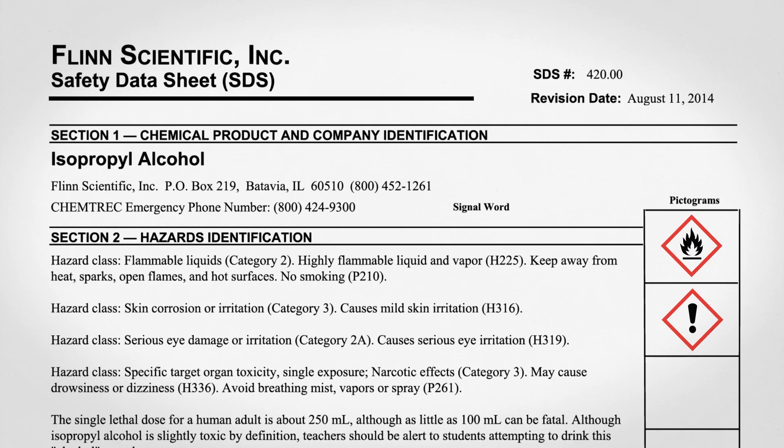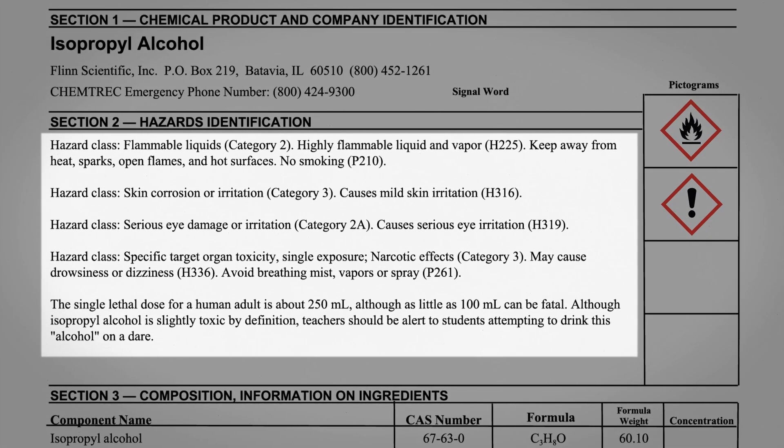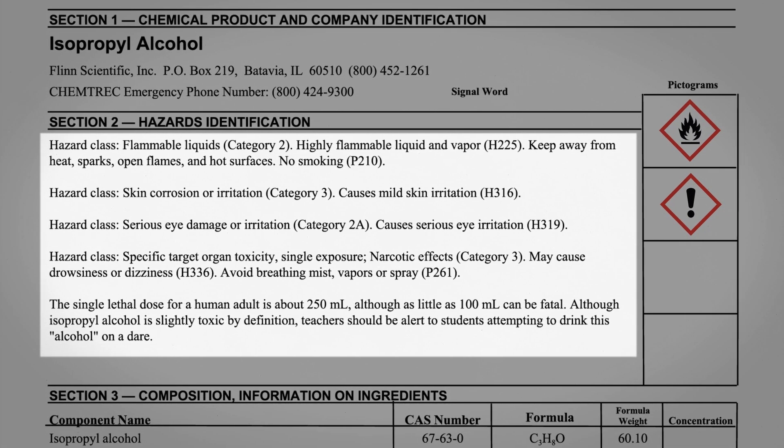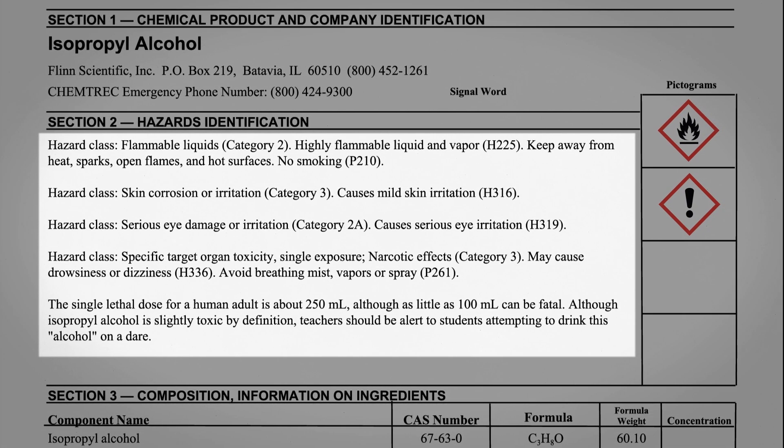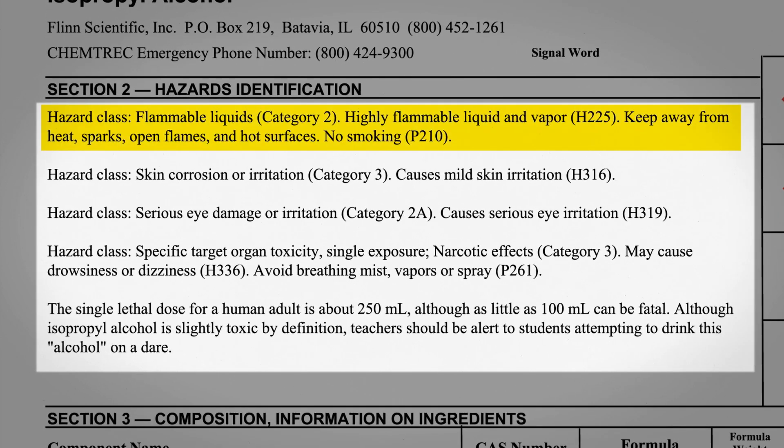The third and most detailed way of identifying hazards is by actually naming specific hazards or hazard classes, described by hazard statements. Isopropyl alcohol has four principal hazards. One: it is a highly flammable liquid and vapor — keep away from heat, sparks, open flames, and hot surfaces. No smoking.